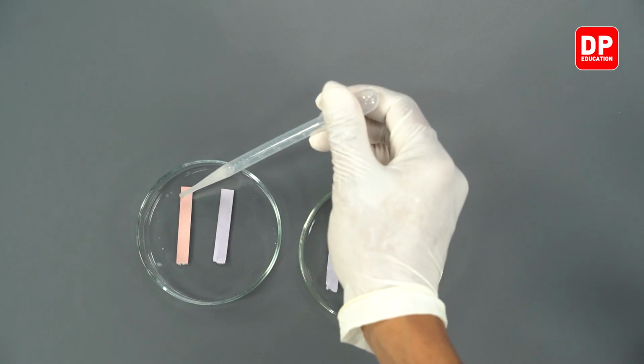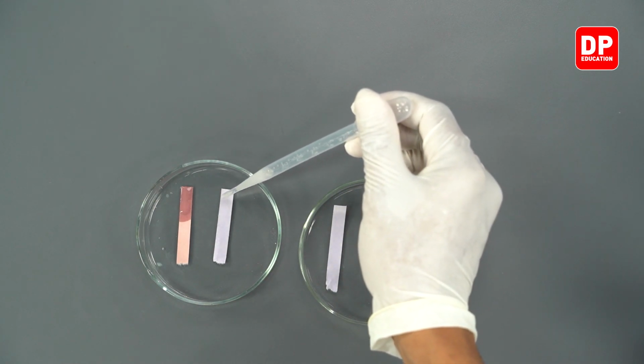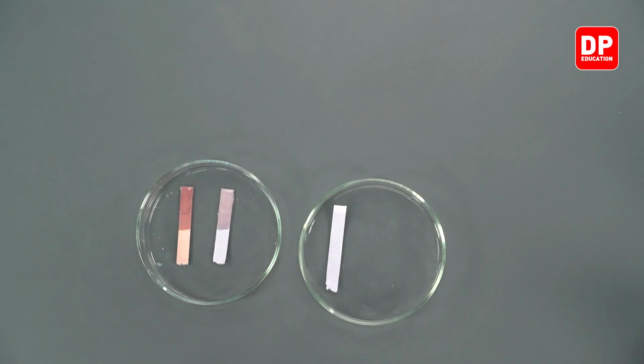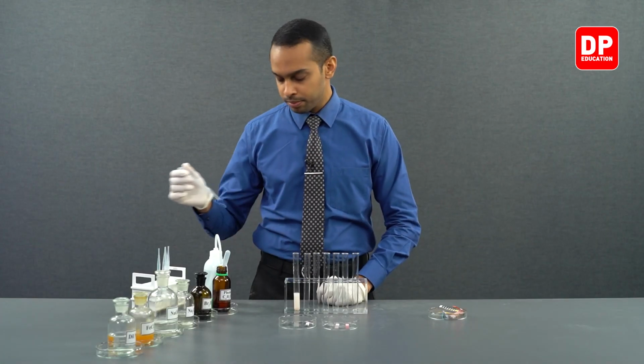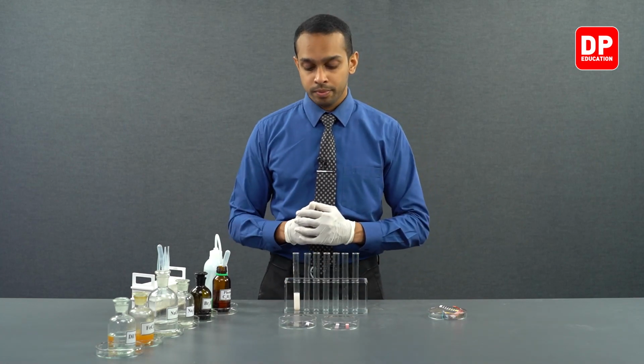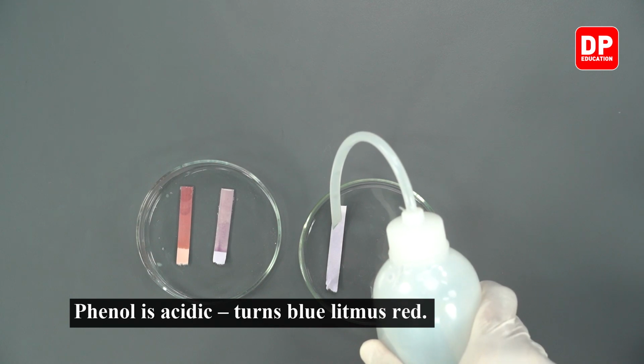the phenol solution onto our red litmus paper and onto our blue litmus paper. And then let's add a little bit of water onto our control.